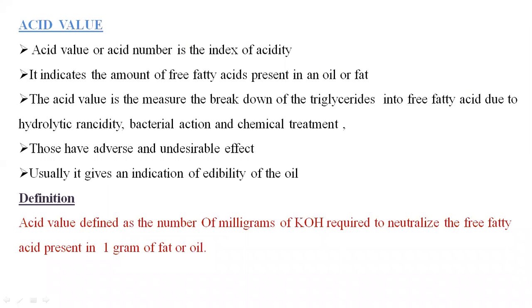How much free fatty acid is generated due to this hydrolytic rancidity and bacterial action, we are measuring. Those have adverse and undesirable effects, and they produce the rancidity of the fats and oils.